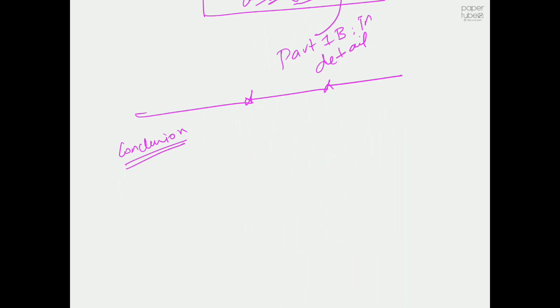So you can calculate the initial crystallization rate. I already showed you how to do that, and I think that's more than enough. Let me check whether I showed the initial crystallization rate. Okay, you don't have to calculate it. Just ignore it. Calculate kV and then your qm value, and that's enough for your report. Try to put those values in the conclusion, and tell that the kinetics, or the whole process, is much faster when you work with a higher seed loading, which is 80% seed loading.